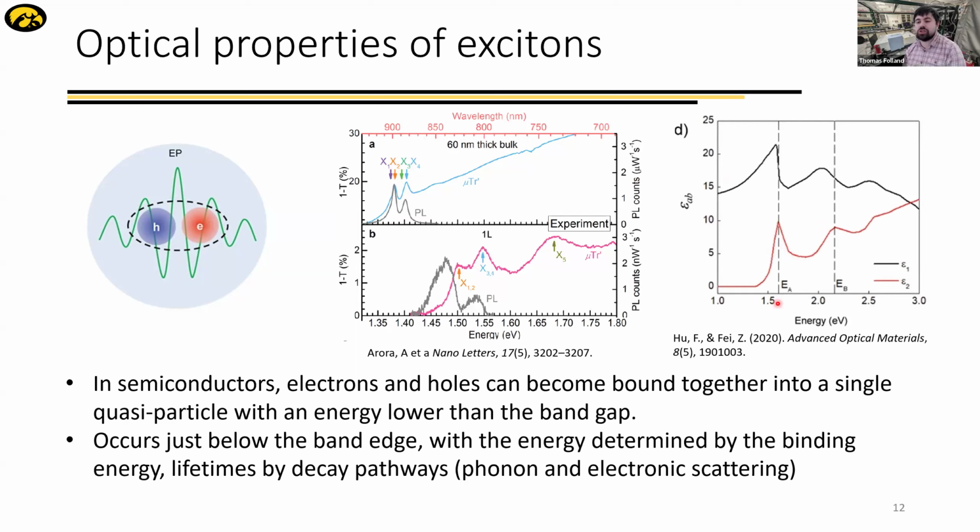If we have these parameterized models, first of all, they can tell us about the properties of materials. Once we fit to parameterized models, we can extract accurate optical phonon energies and phonon dampings. But one of the strengths of optical spectroscopy is that we can also directly use this optical constant information if we're making, say, optical devices or using optical materials for different things.